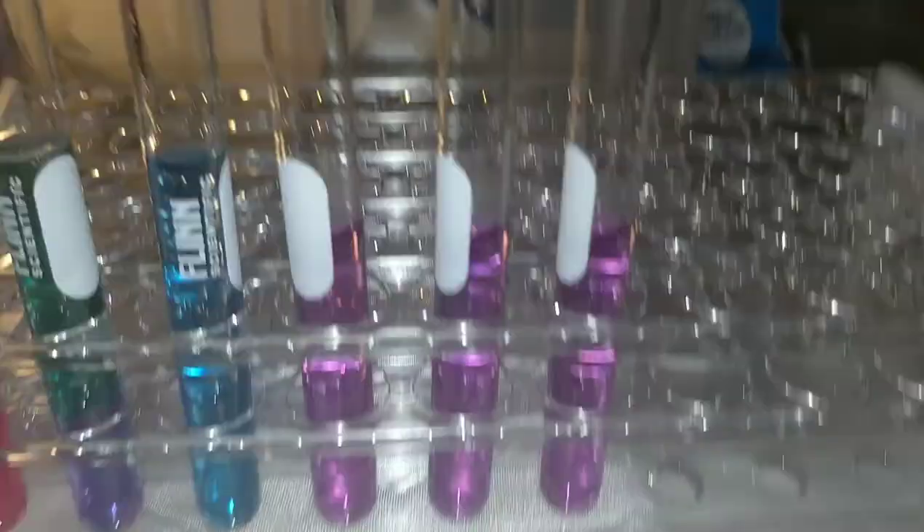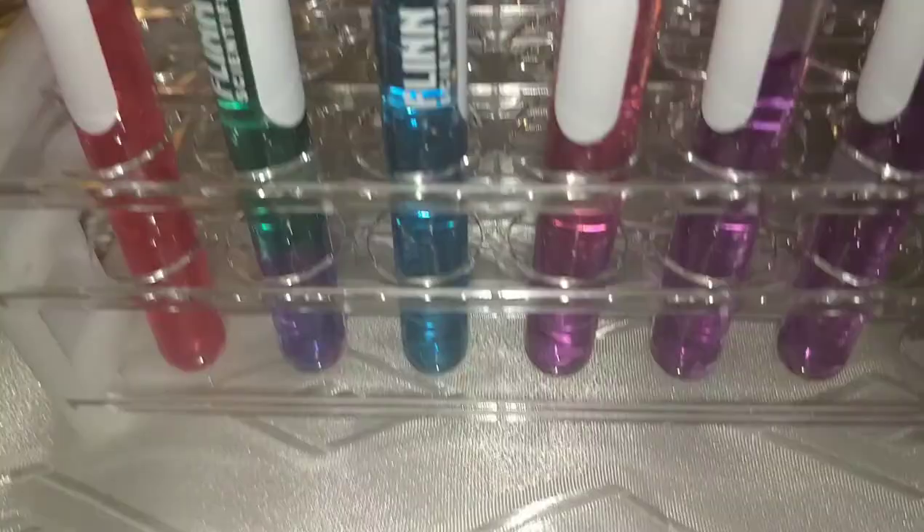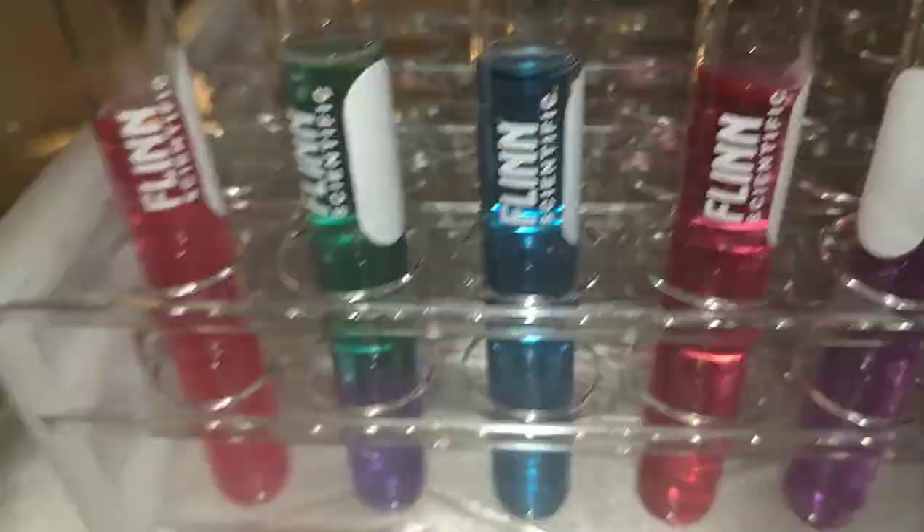Next I'll test the vinegar — one milliliter added. In comparison to our other acidic solution, in real life it looks just a bit less red, more towards the purple side. Let's say it's a darker red or a more purple-red. I'll record it.